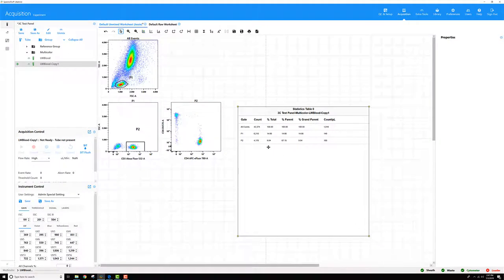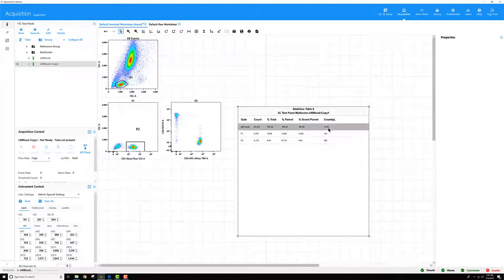I'll go ahead and make that table. You can see here a count per microliter has been applied to all of my gates that are in my worksheet.